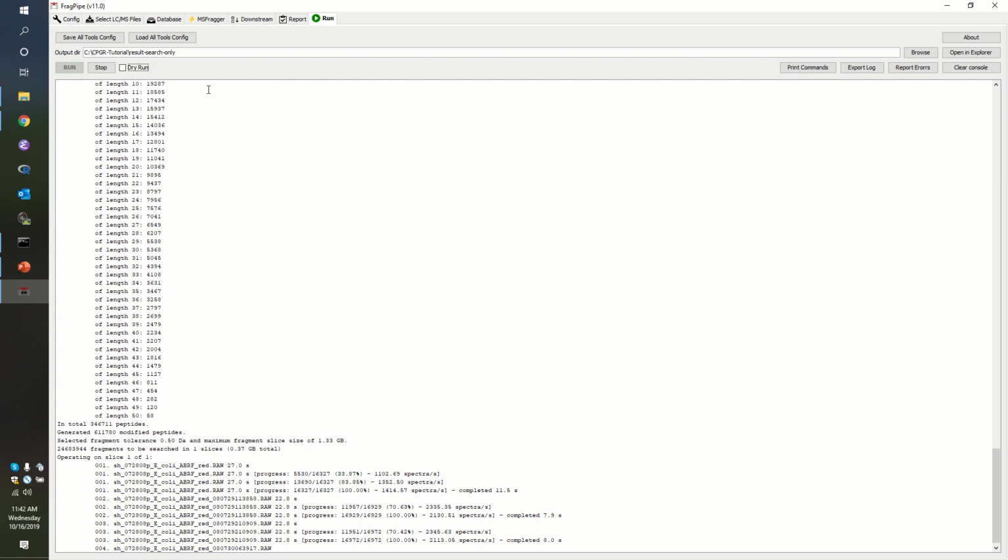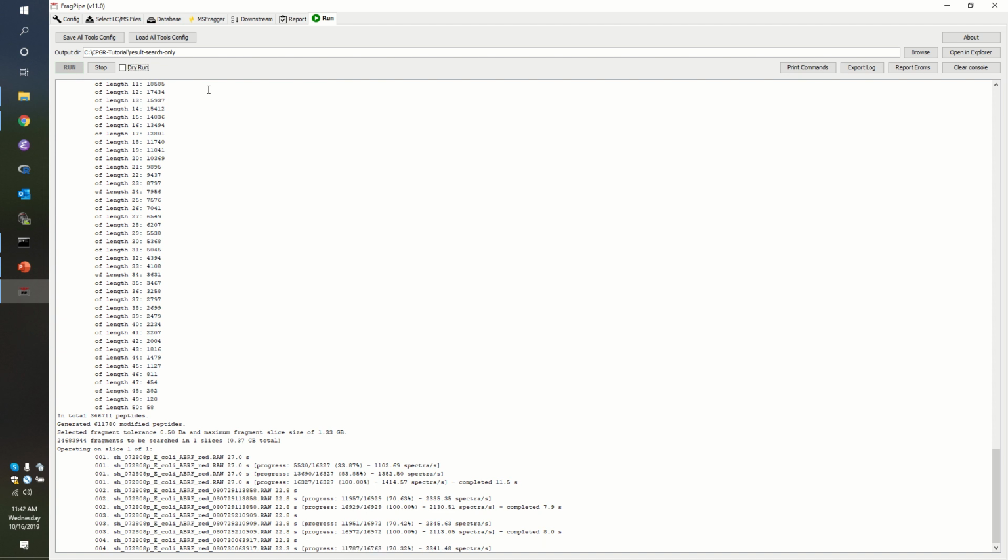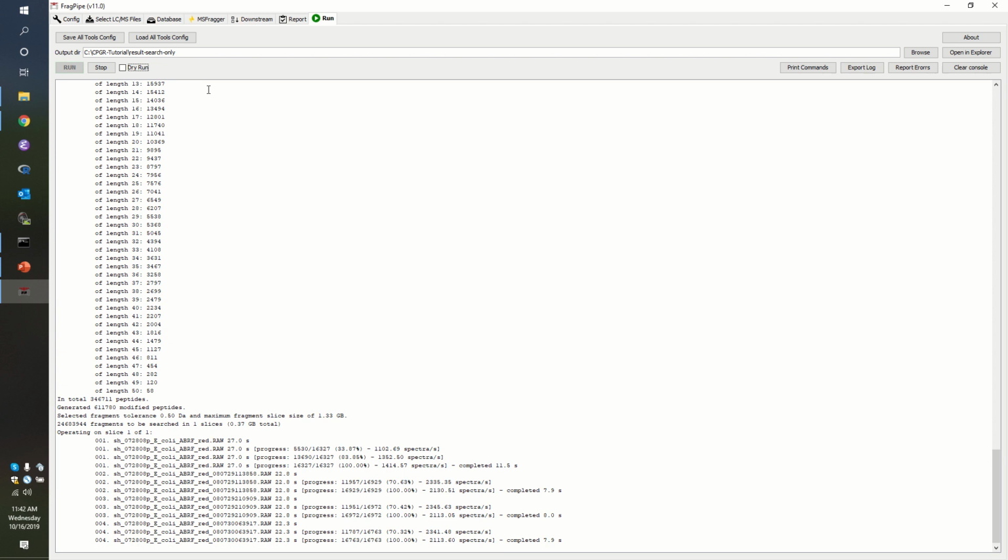So you have a laptop with 4 gigs of RAM and a 64-bit VM, but it's saying, I need more memory than 4 gigs to run this search. See, I didn't run this demo on a 4 gig machine to test that, so I'm really glad to have that observation. My laptop has 8 gigs of RAM, and that's just enough extra to make the difference, I think. I should have caught that beforehand. I'm sorry about that. I just can't install the actual Java GUI. Okay, and is it behaving itself on your machine?